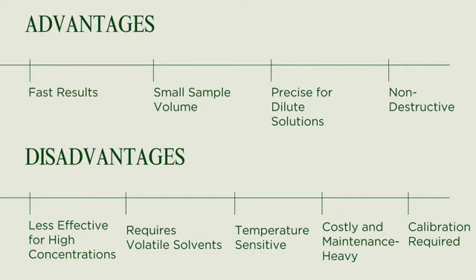The device can be very expensive and may require regular maintenance, particularly to ensure the precision of the thermistors and the overall system.